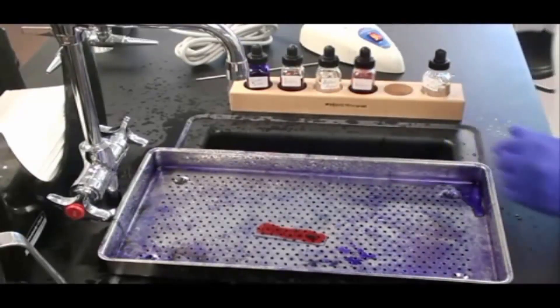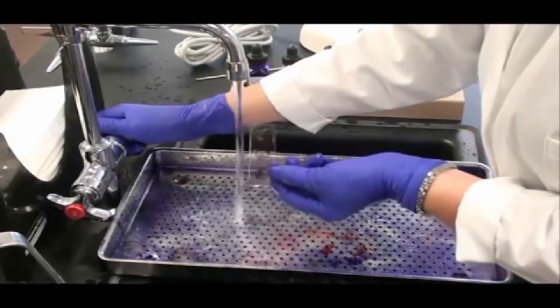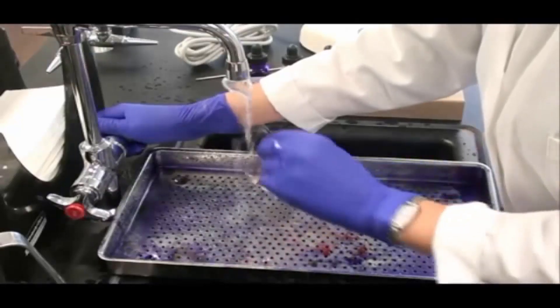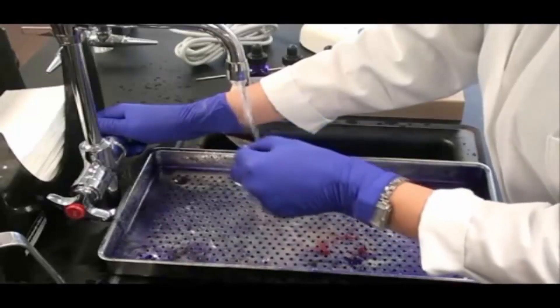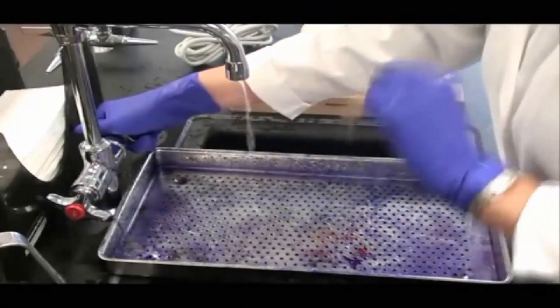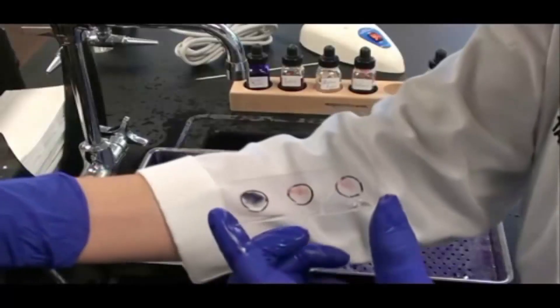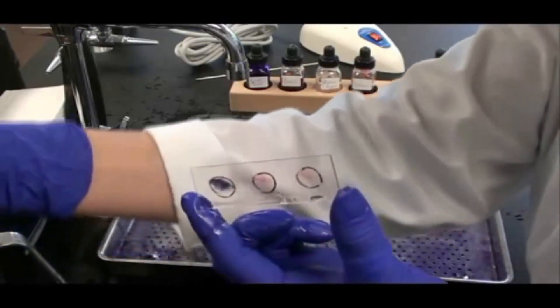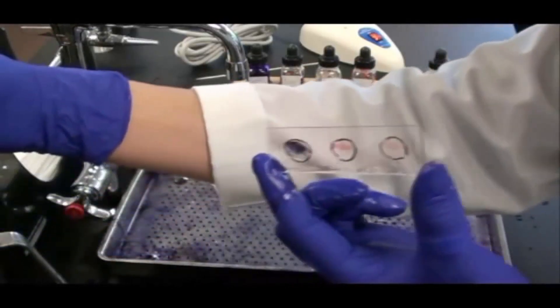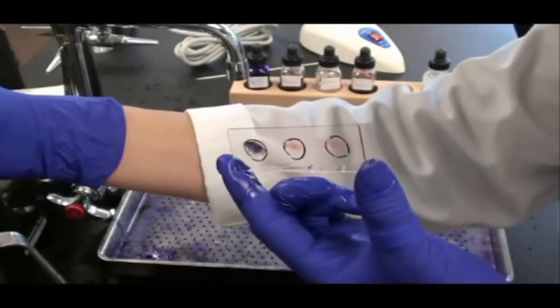And then I wait for one minute. At the end of that minute I rinse my slide — this will be the last step. Now let's take a look at it. The slide I just prepared has a Gram-negative unknown. I see my positive control on the left, my negative control on the right, and my unknown in the center is pink like my negative control.